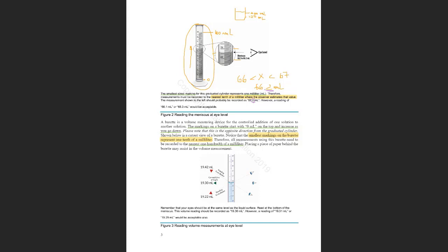So if you are using this graduated cylinder, the way to report is only 1 decimal after the dot. So if I ask you how to report this number and you tell me 66.25, that will be incorrect. Does it make sense? Okay, that only applies to, for example, the ruler, where we said 15.25, but because this is liquid.